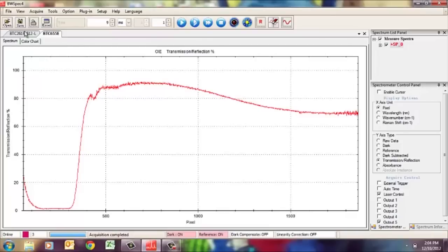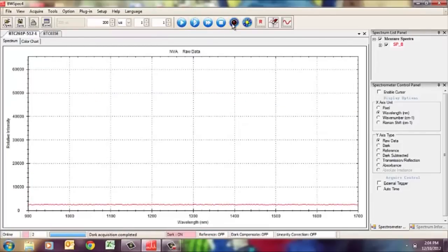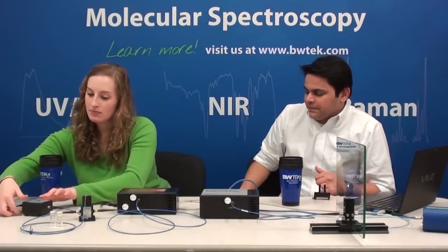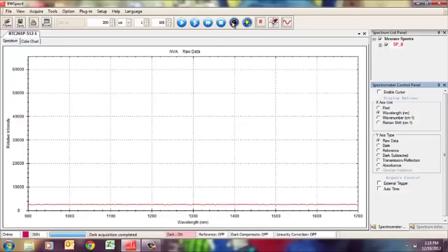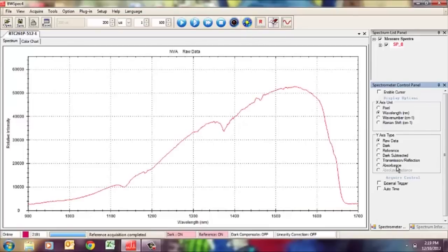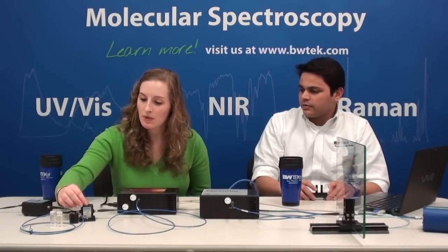I'll collect the dark spectrum first. Then with the light source on, I'll put in the empty cuvette for a reference scan. We use the empty cuvette for the reference so that any interference from the cuvette itself is accounted for — that way when we measure the water and the oil, we're only measuring the transmission spectra for those substances. As you can see, the transmission goes to 100% with the empty cuvette reference.